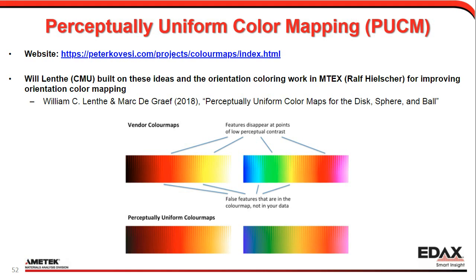At the top of these, I've done a 10% variation in the value used for the color scale. And you'll notice in the top row for the thermal one, the red really disappears, black disappears, the yellow disappears. In the other one, you see that the green really disappears and the red disappears.